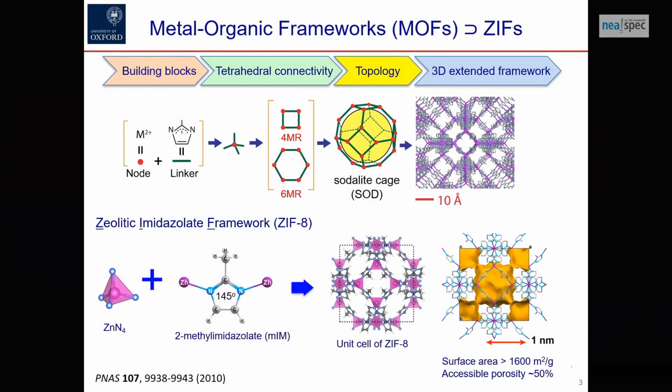So here are the general construction of MOF materials. I'm going to illustrate this using a prototypical framework material called ZIF, which stands for zeolitic imidazolate framework, particularly this guy, ZIF-8, which is a nice exemplar. Although we are in the inorganic session, actually the material, as you can see, is a hybrid. So we got metal components as well as the organic building blocks.